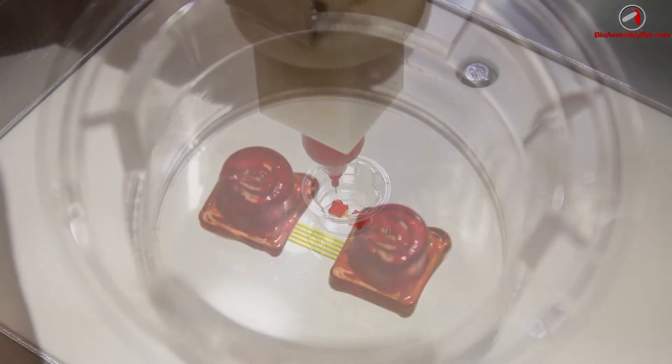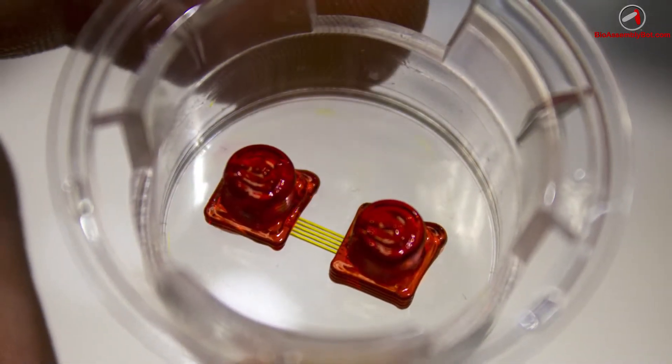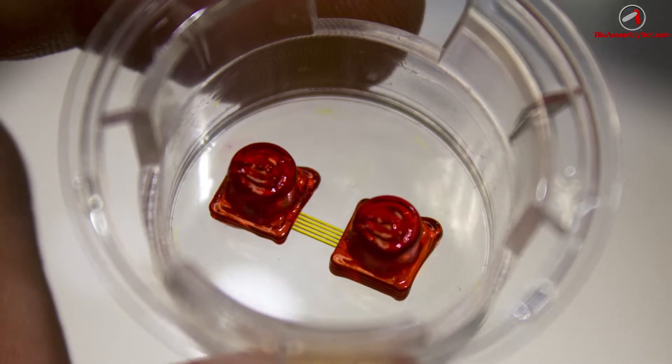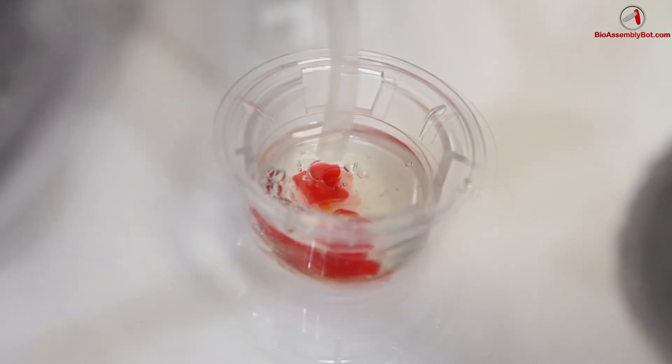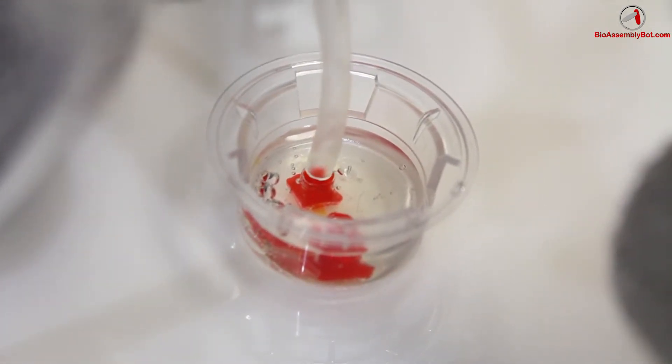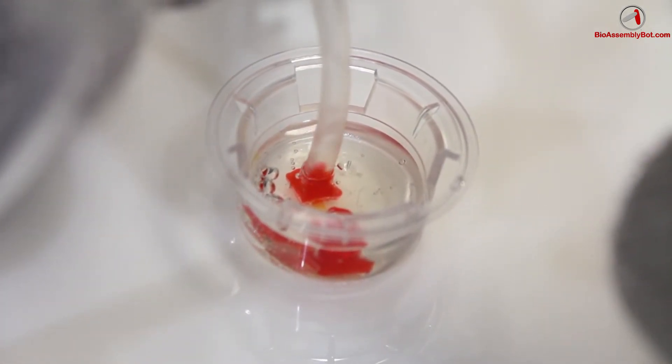Shown here is that finished print prior to backfilling with a more solid material. In this case, it's acrylate that is photoactivatable to cure it.